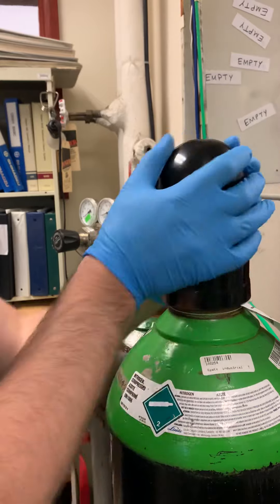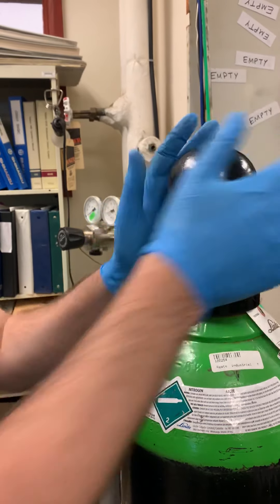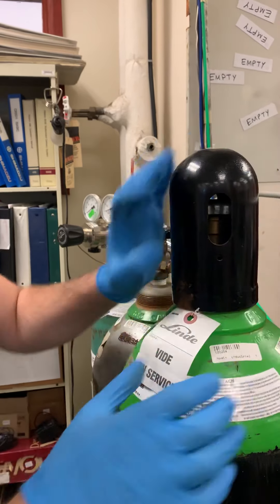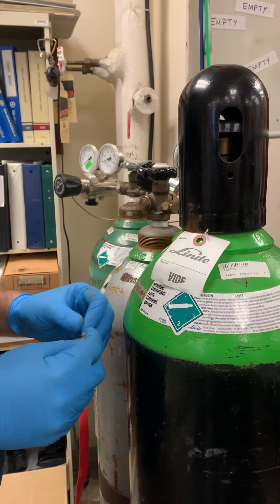Put the lid on to protect the top tap. Just trying to make sure that everybody knows that it is vide.